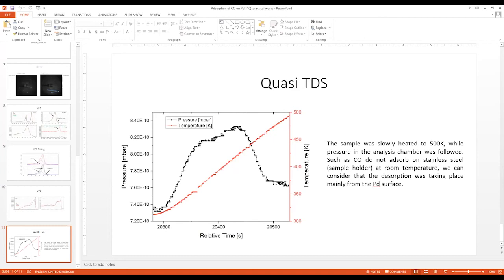You have the source, which has a long capillary, and you have the window, which has the form of a cone. At the end of this cone there is a small window, and you approach the window with the capillary. However, as you have a discharge there, there is quite a lot of helium gas and also some heat together with ultraviolet, which heats this window, and it breaks after a short time. So it's good that we have a new one. We just recently received the new one, which is covered by aluminum.